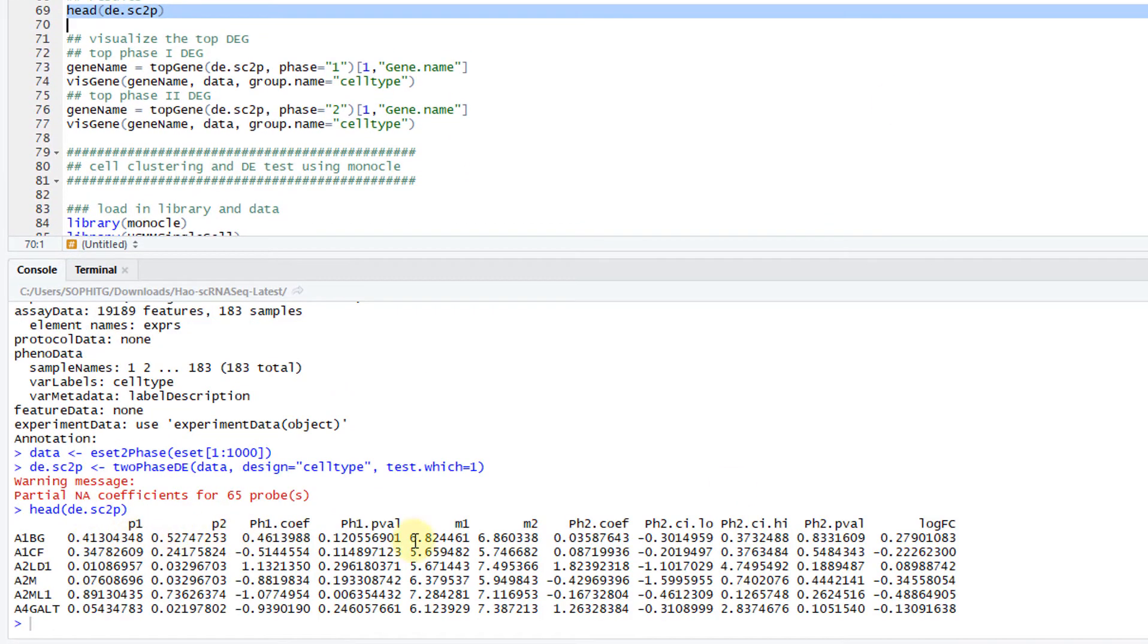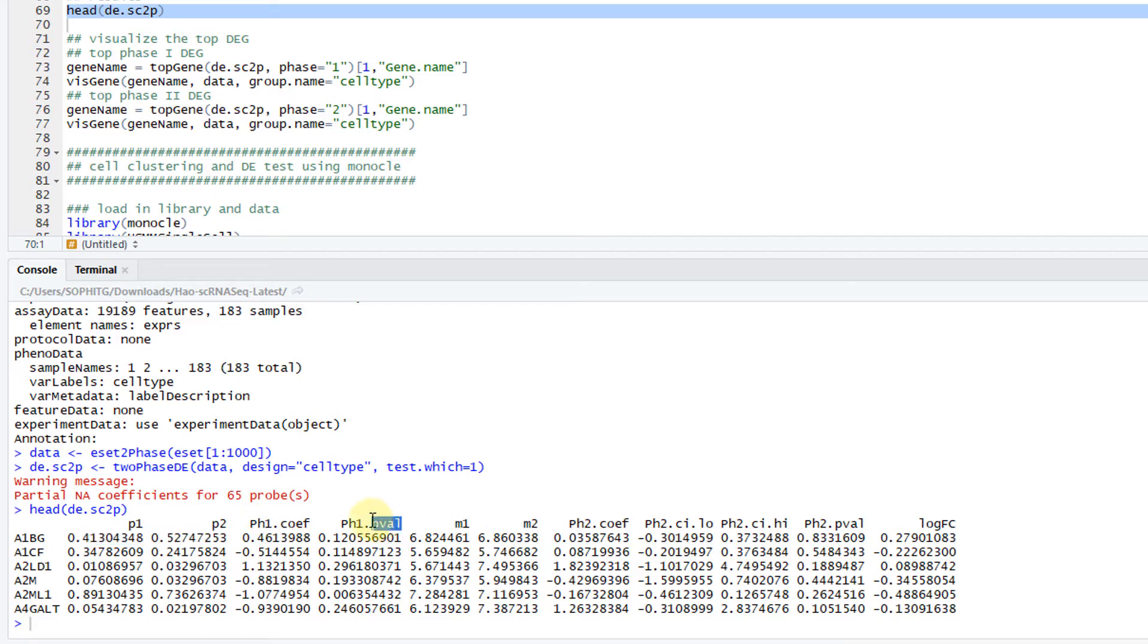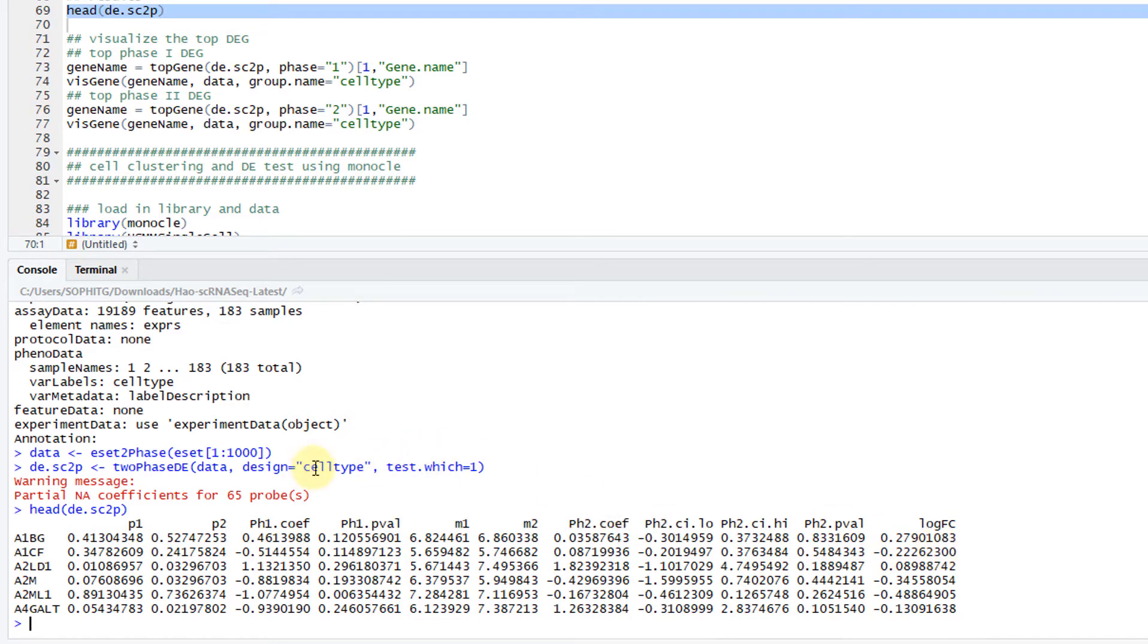Basically you have a lot of information here. The p-value for the first phase, for the second phase. These are the turning on percent, the percentage of genes are on. The coefficient, the p-values here, the phase one p-value, phase two p-value, some confidence intervals and the log fold changes.